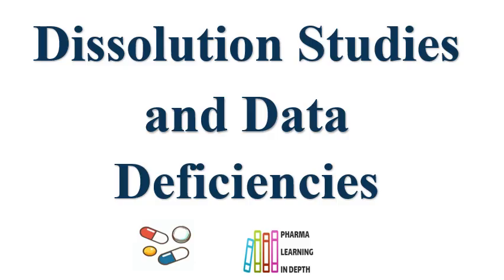Dissolution studies are performed in all stages of the product life cycle, and if there are some dissolution deficiencies, dissolution study requirement gaps, or insufficient data in the product filing, then regulatory agencies raise queries regarding the dissolution testing and the required data. This video is on the same topic, and let's see how many studies are to be done and what type of queries and deficiencies are raised by the regulatory agencies.